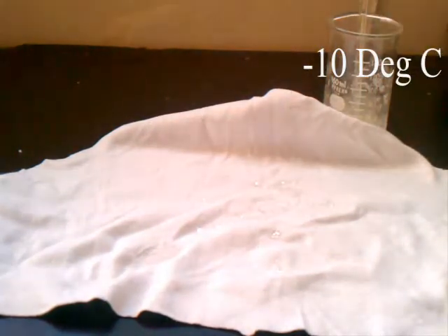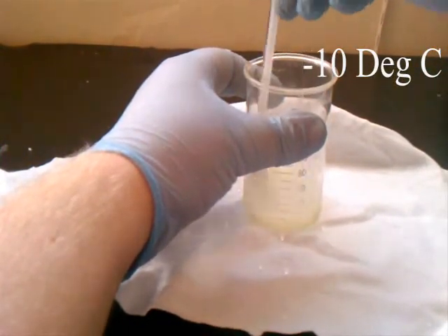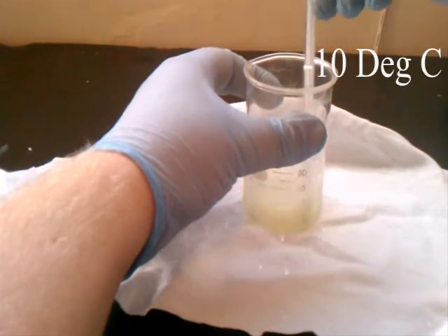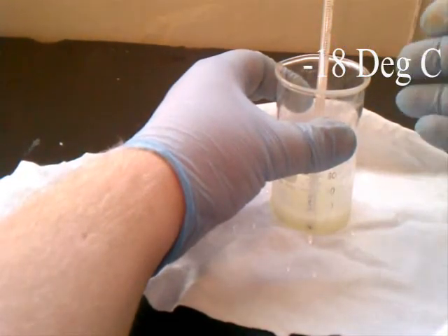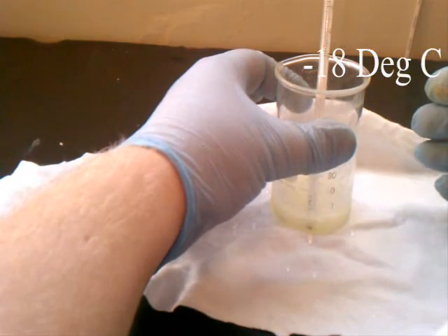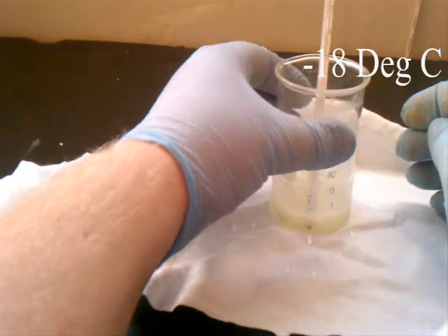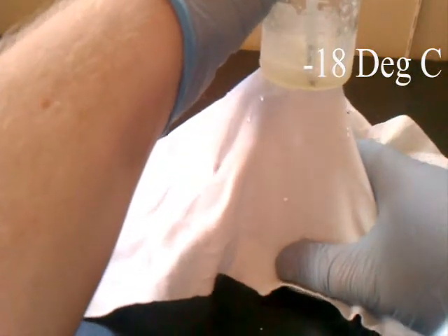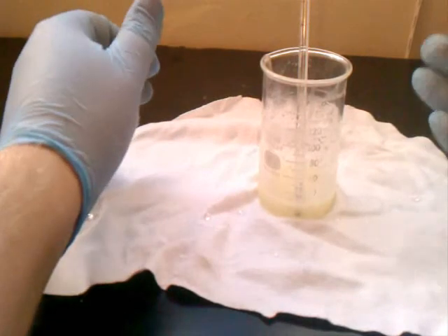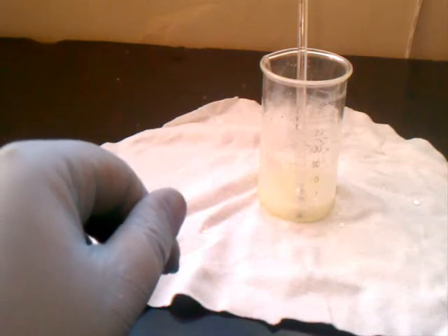One thing we can do — it gets so cold — is put it into contact with some water. Usually this is done with a block of wood, but a rag will do just fine. Just stir it up a little bit more. We are down to negative eighteen degrees right now. If we take and try to pull the beaker off of the towel, we will see that it is frozen to the towel — really frozen on there, you can't get it off. So there you have it: the reaction between barium hydroxide and ammonium thiocyanate produces an even colder endothermic reaction than dissolving ammonium nitrate into water.